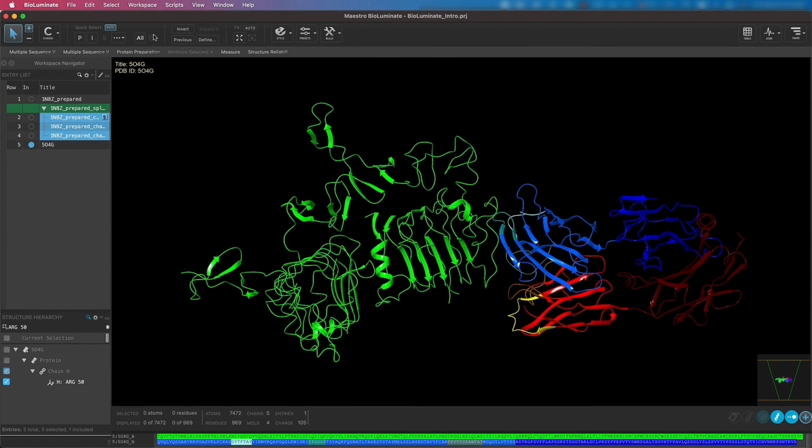In this video, we went through how you can rename residues and chains, as well as how you can view project data in the project table.